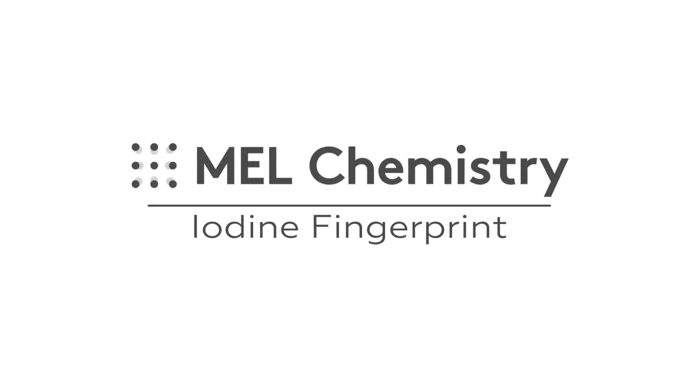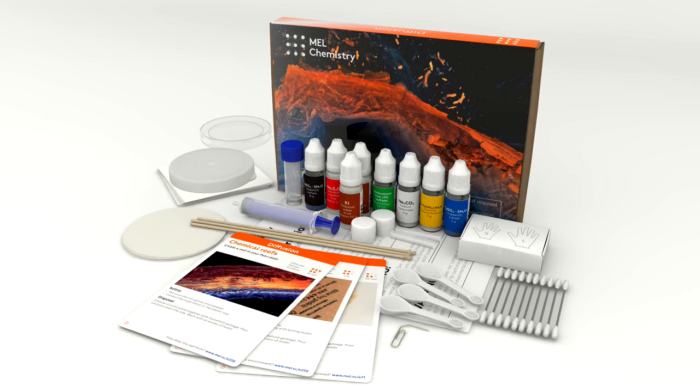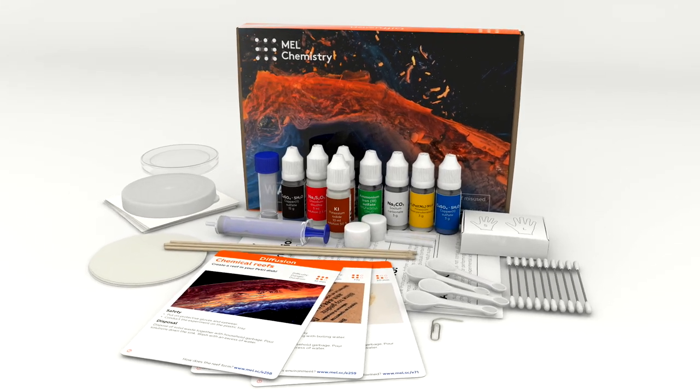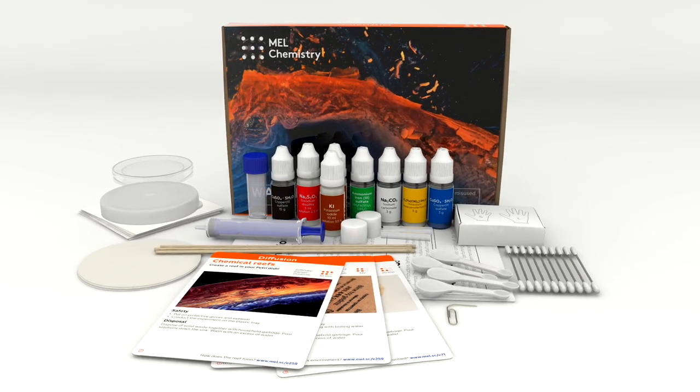Welcome to the wonderful world of chemistry. Today, with the help of the diffusion set by Melchemistry, we will learn how to reveal fingerprints using iodine.